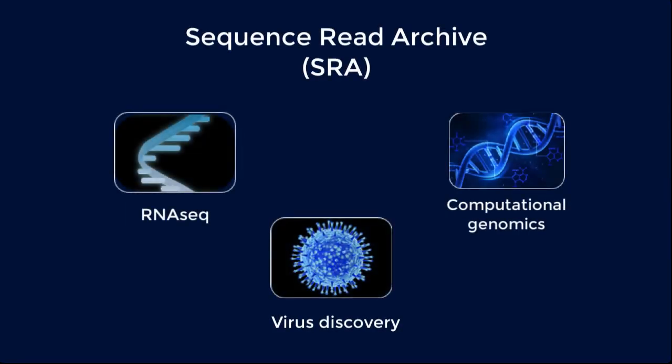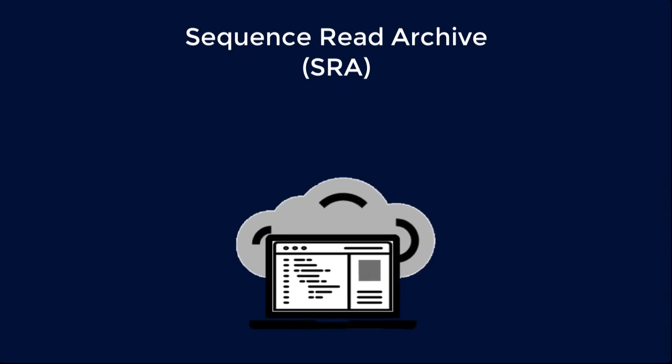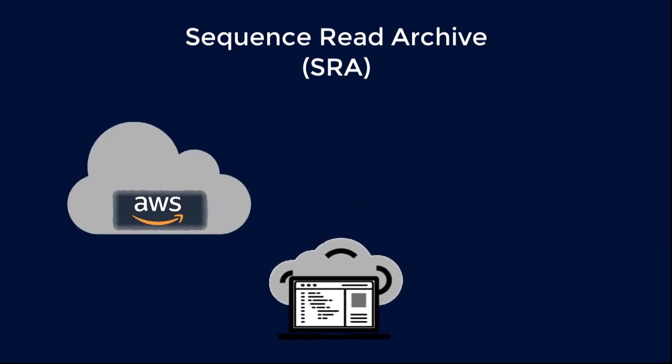You can now access all of the Sequence Read Archive's vast public and controlled access human datasets in the cloud, transforming any laptop into a high-performance computing device. And this can ease struggles with speed and storage issues you might encounter using FTP to download large datasets from the NCBI. This short video demonstrates the steps needed to access public SRA data with Amazon Web Services.